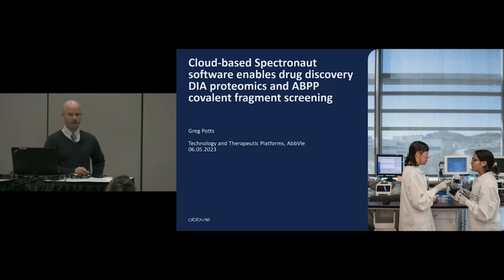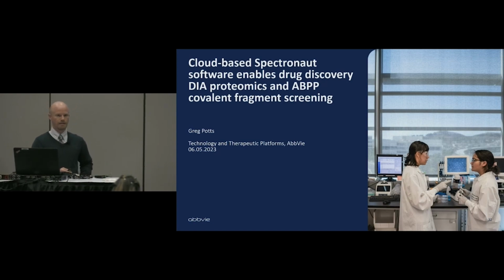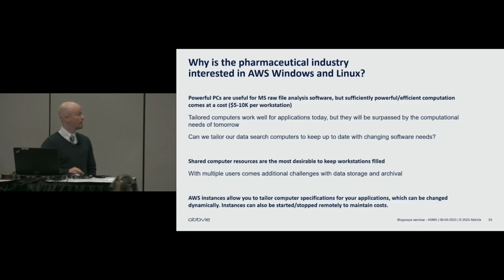So today I'll be talking about Spectronaut 18 and the recently released AWS version of Spectronaut 18, which we were able to benchmark prior to the conference, and the application of Spectronaut for activity-based protein profiling workflows, where we've basically translated those workflows into DIA-based analyses.